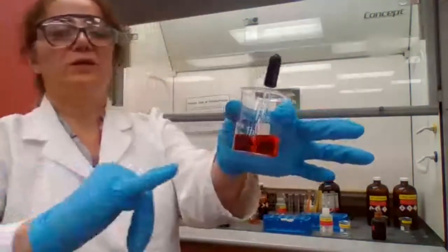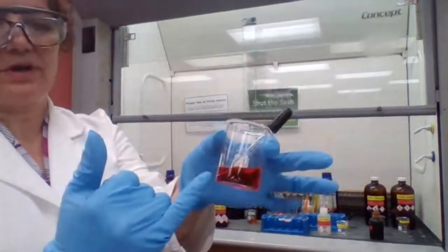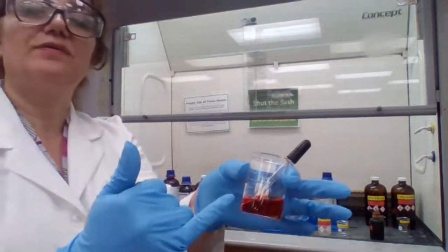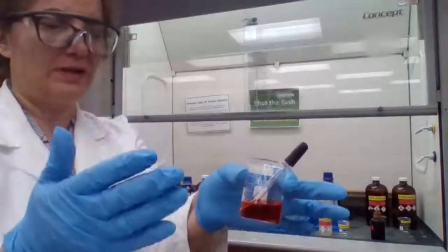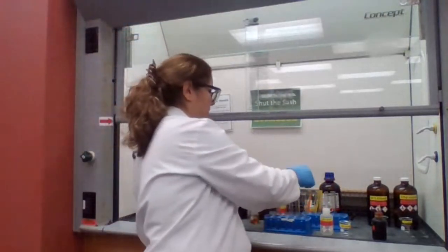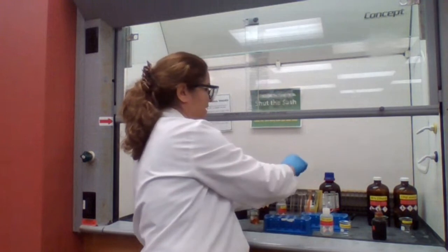You can look at the color of the chromic acid before being added to any of the chemicals, because you want to have a reference color. This is the color. If there is no reaction, the color is going to stay. If there is a reaction, the orange color of chromic acid is going to change to yellow, to green color, and you would see a shade of green color in the test tube. So I'm going to add chromic acid.